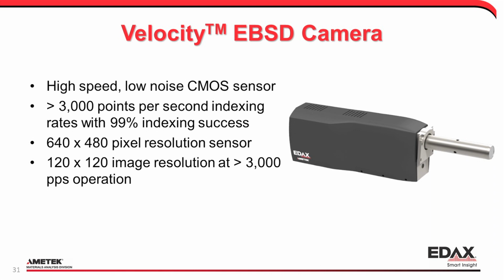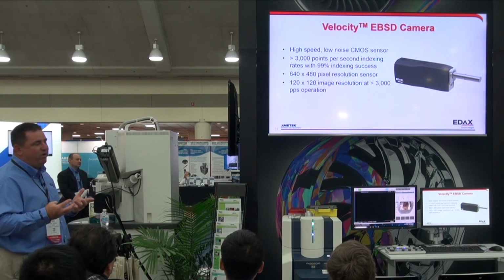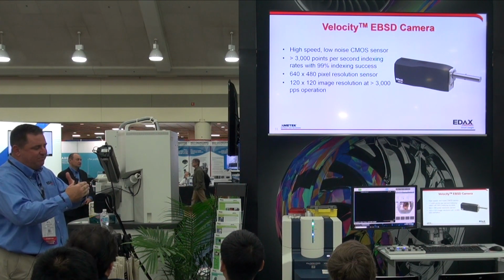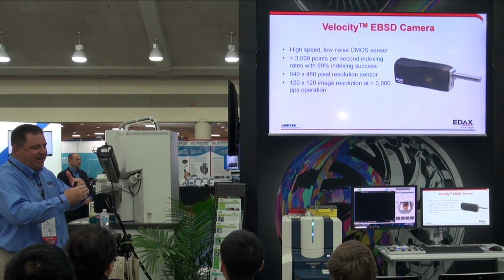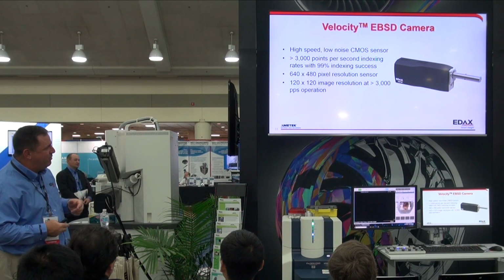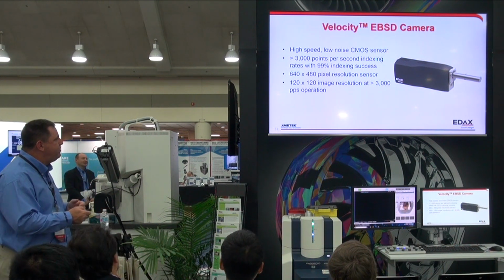The reason for that is, one, it allows us to transfer via just Ethernet. Two, our Hough transform works well at that resolution. If we go too high in pixels, it has more trouble finding the center, it finds things differently than at this sort of 100 by 100-ish resolution. So that's where we targeted the operation.